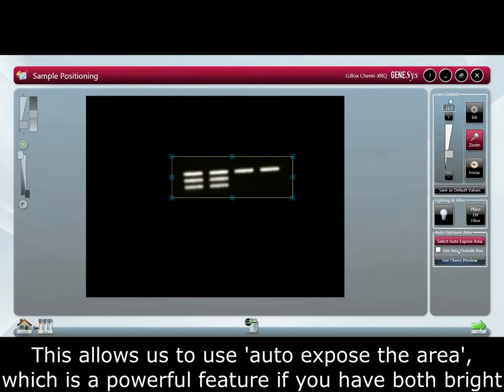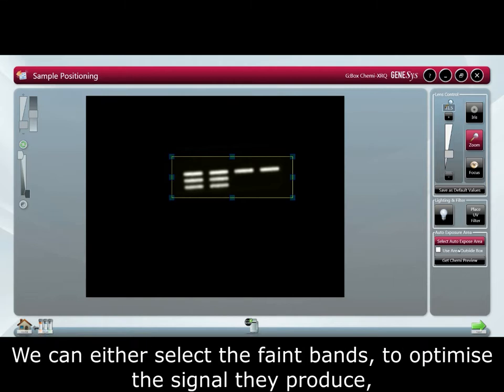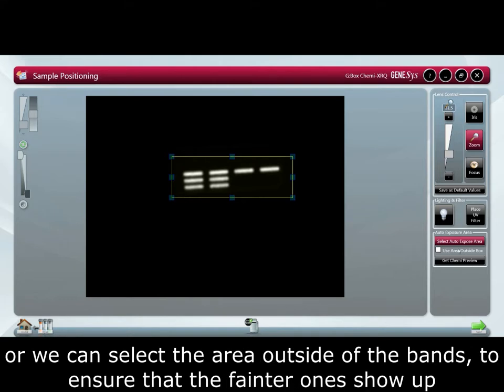This allows us to use auto expose area which is a powerful feature if you have both bright and faint bands on the same blot. We can either select the faint bands to optimize the signal they produce or we can select the area outside the brighter bands to ensure the faint ones show up.